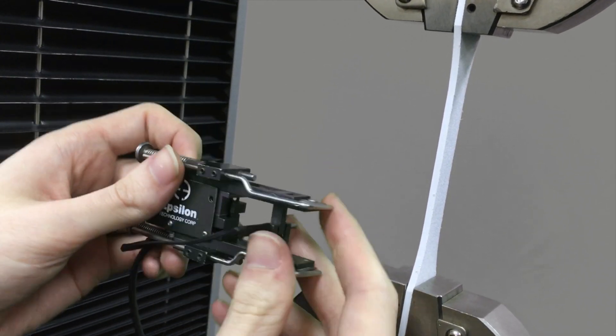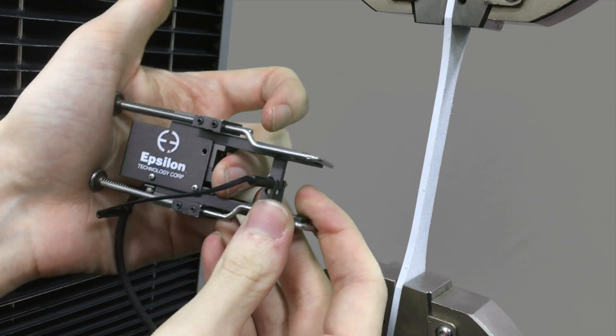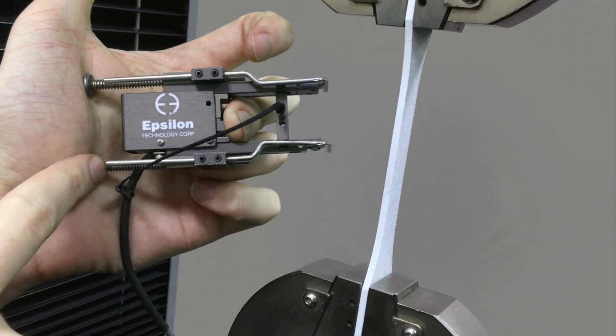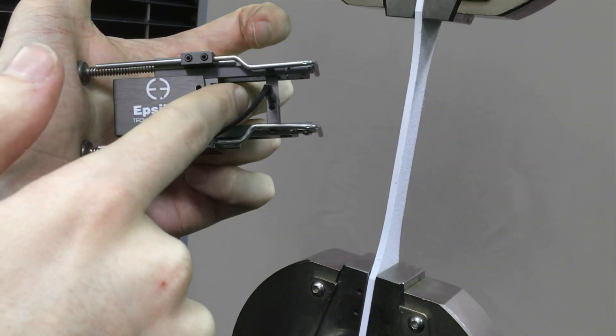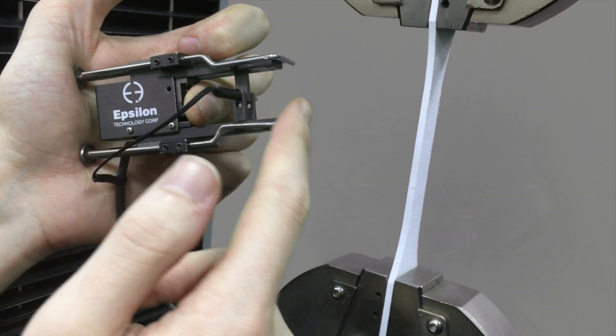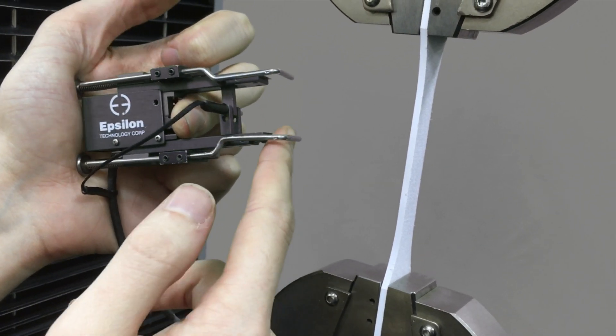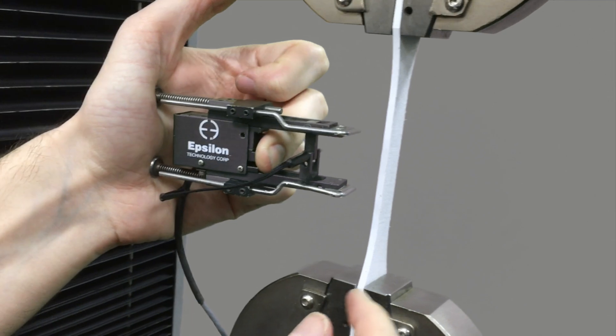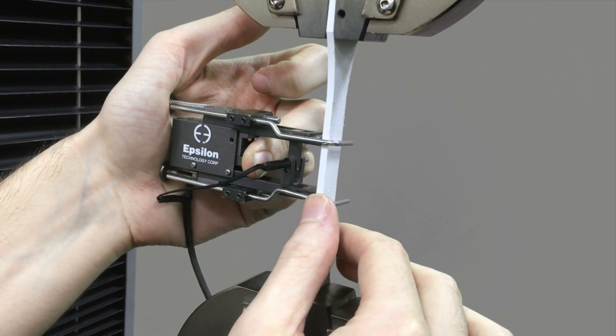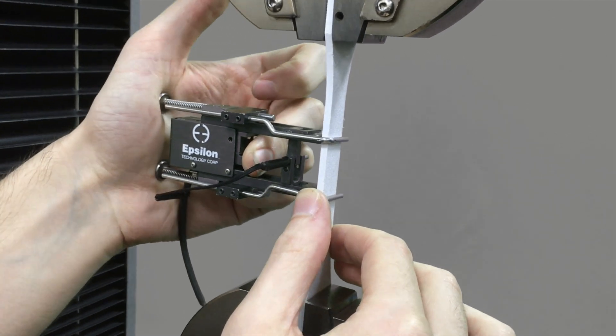In order to insert the extensometer on your sample, in this case there's these two pins here. What you do is put your middle finger here and simply push these two pins, and it allows these metal clamps to open the teeth. So what you're going to do is push those pins in, set it on your sample, and let go.